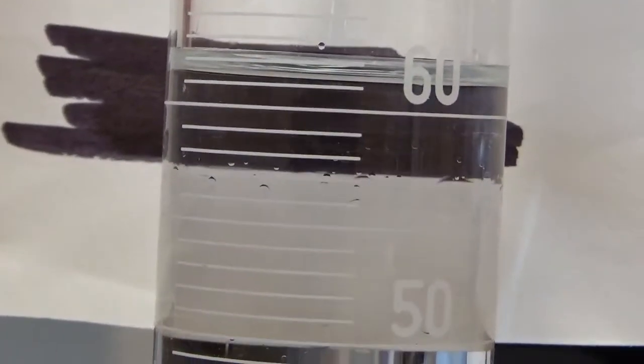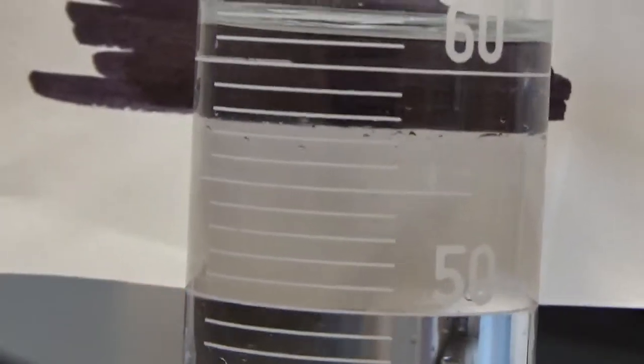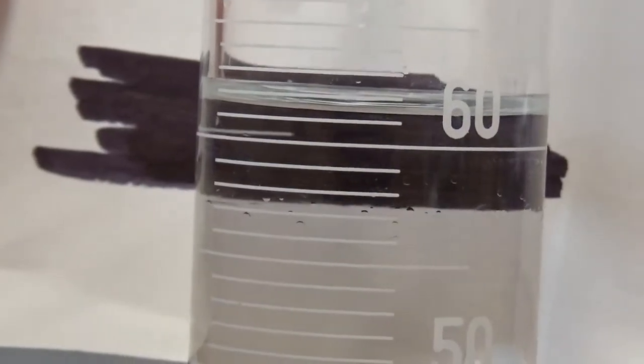It looks like it's like 61 point, maybe 0.3. So 61.3 and 15.0 total volume.